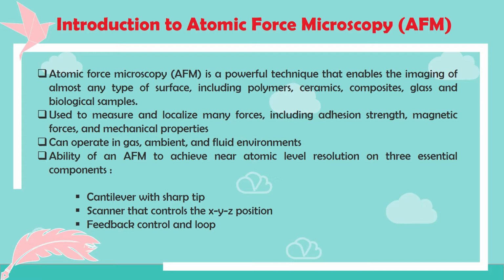Assalamualaikum and hi, my name is Nashafika and I'm going to start with the introduction to atomic force microscopy. Atomic force microscopy is a powerful technique that enables the imaging of almost any type of surface, including polymer, ceramic, composites, glass, and biological samples. It is used to measure and localize many forces, including adhesion strength, magnetic force, and mechanical properties. It can operate in gas, ambient, and fluid environments.